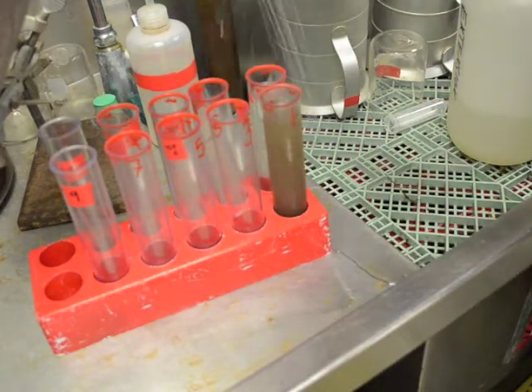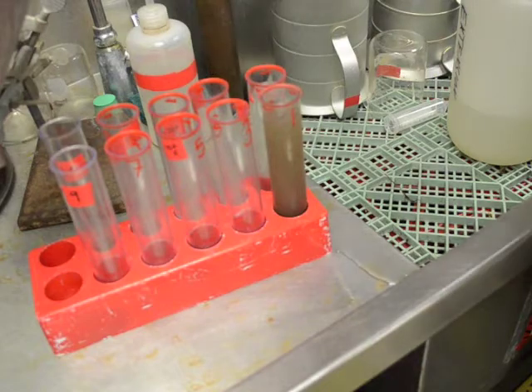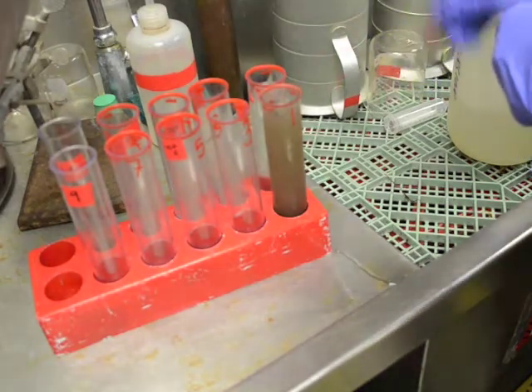Once thoroughly mixed, return the sample to the centrifuge for another spin at 3 minutes at 3500 RPM.